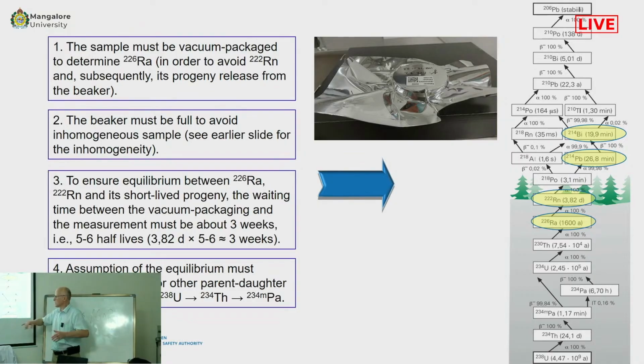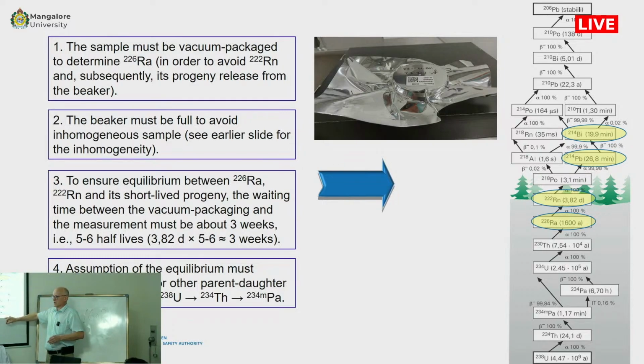Leach, yeah. So leaching may be different in those cases. But in case of rock samples, I think leaching is not an issue. But every time you have to think about this equilibrium. Leaching is a very relevant thing.